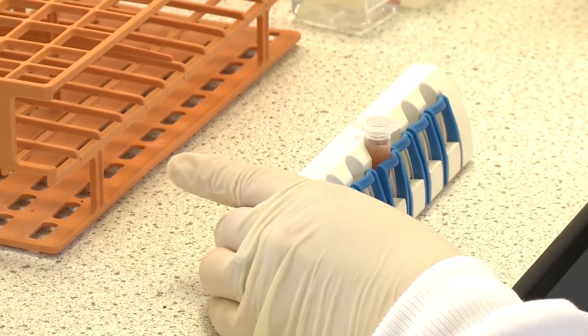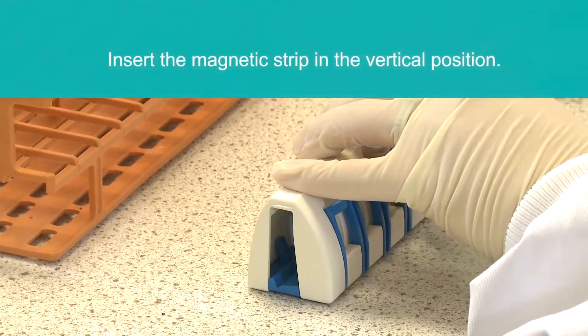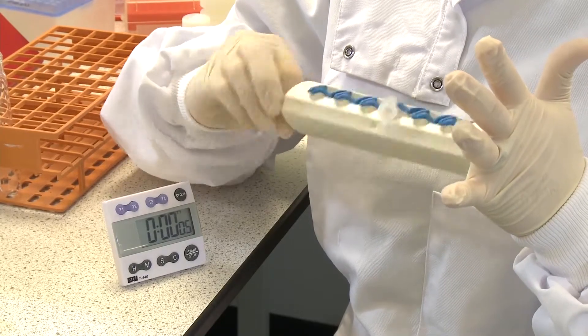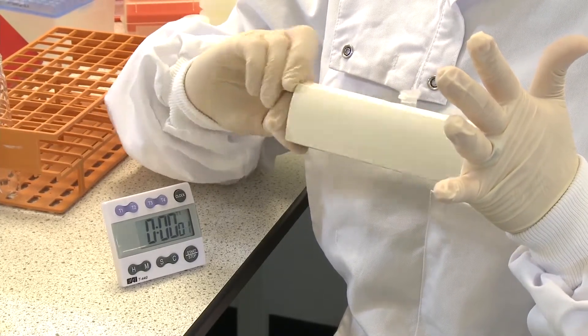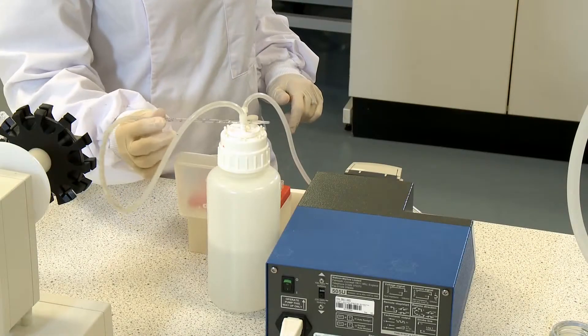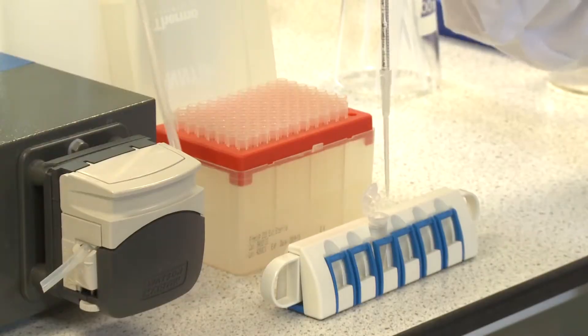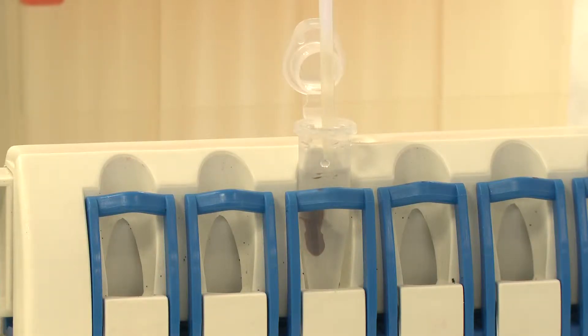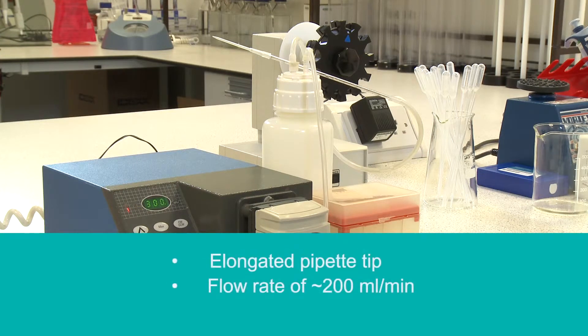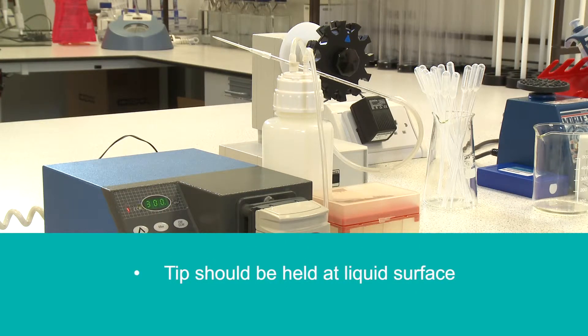For the IMS secondary capture, cap the tube and insert the magnetic strip into the vertical position, then rock-roll the MPCS at 180 degrees for one minute. Without removing the magnetic strip, aspirate the supernatant using the recommended IDEX setup: peristaltic pump, silicon tubing, elongated pipette tip, flow rate of approximately 200 millilitres per minute, with the tip held at the liquid surface. Ensure that all liquid is removed from the tube and cap.